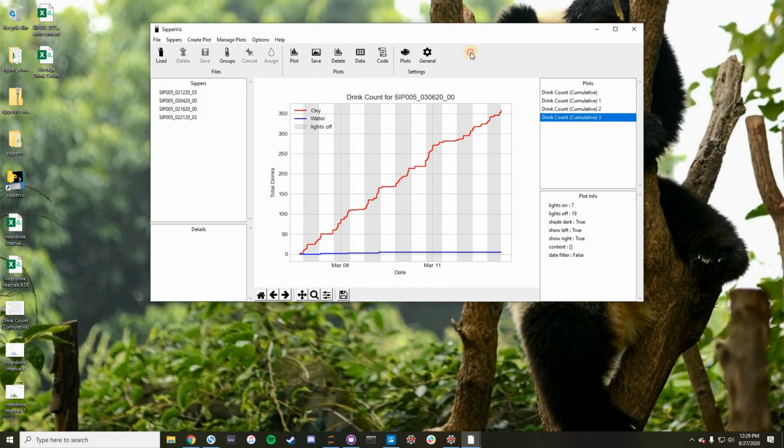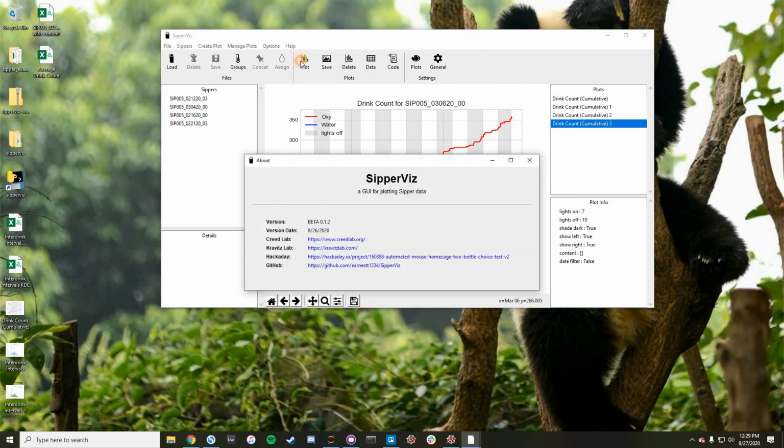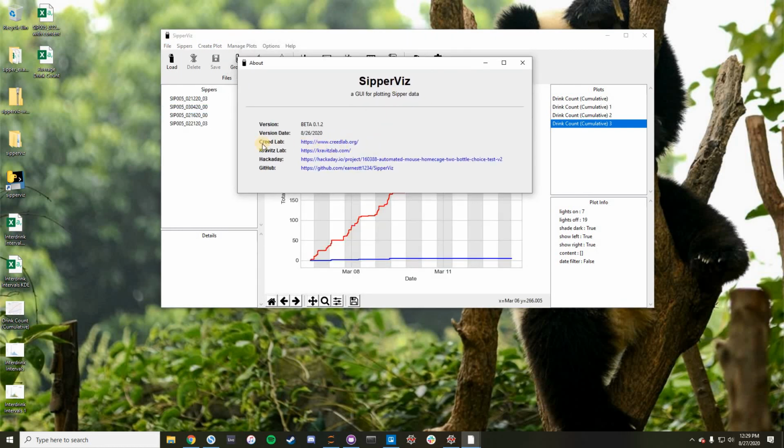Okay, I think that's it for these little bonus features. Also, there's just this About tab here with some links to different lab pages and the Hackaday and the GitHub as well. Probably put a link to this video series once it goes up as well.